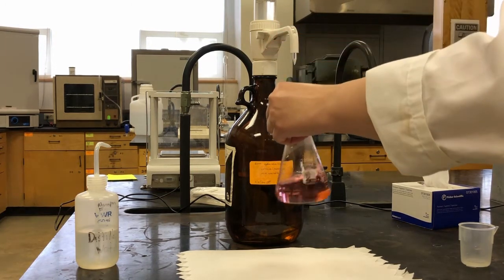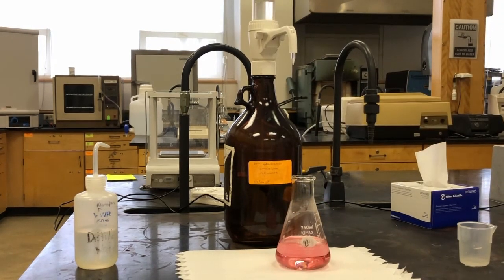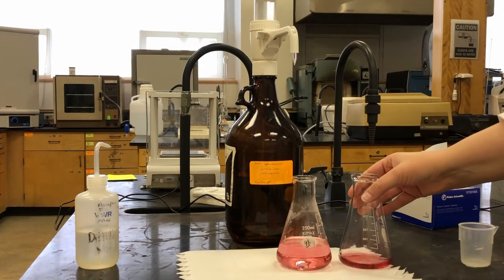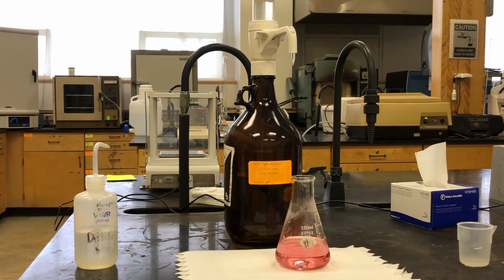Okay, there we go. So you can see we're right back to that original color that we started with of the boric acid. So we've reached the end point of our titration. So the volume that we added will be the volume that we'll use in our calculations that we can use to calculate the amount of ammonia in our sample.